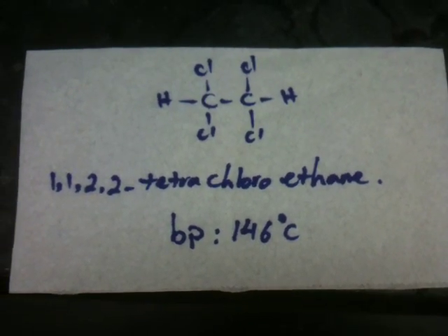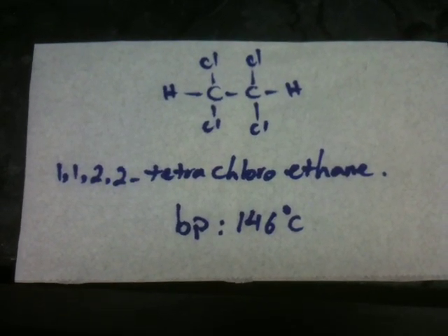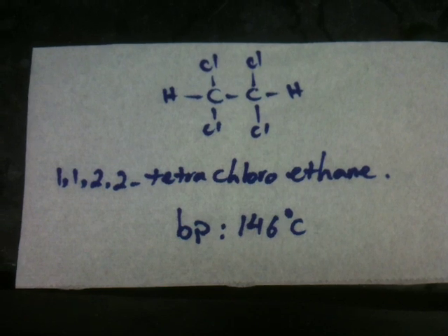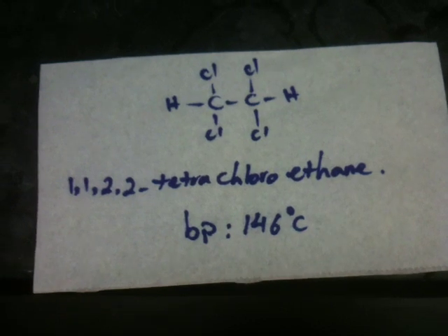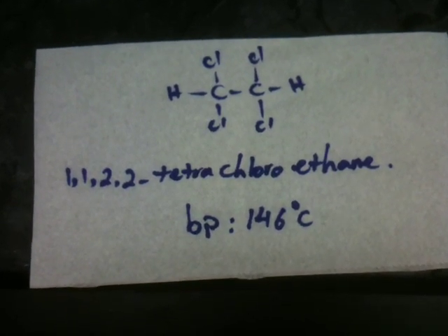Hi, today I'm going to show you how to distill tetrachloroethane. Its boiling point is at 146°C. Therefore, distillation of this compound is performed under reduced pressure or high vacuum.